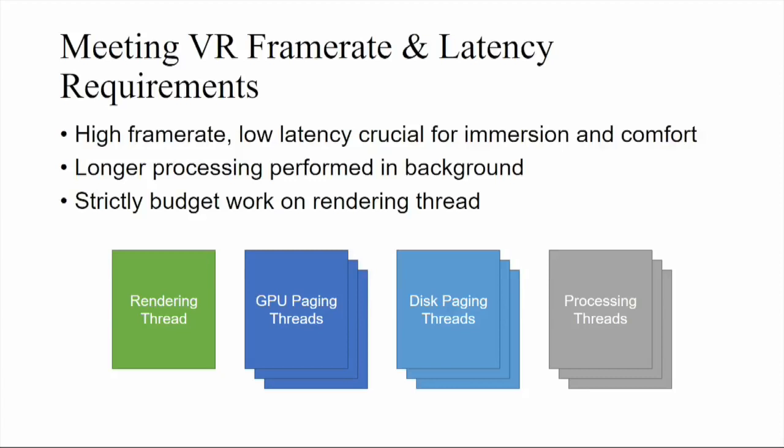And so even with hitches and drops, if you start turning on VR reprojection, this feels okay if you're not interacting with something, but as you start dropping to 45 frames per second and you're tracing your hand in front of you, you'll see it actually jittering. And so it doesn't work as well if you're trying to provide an immersive tool for people to use.